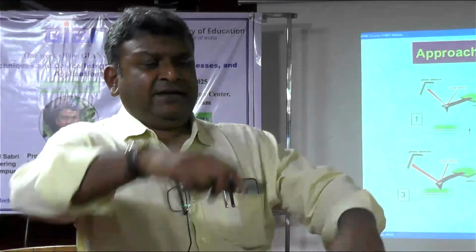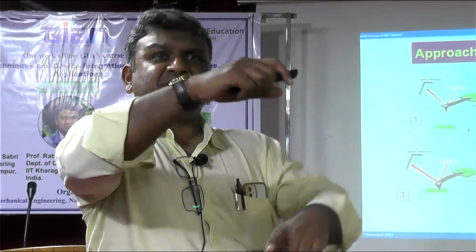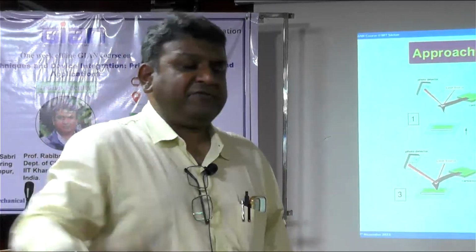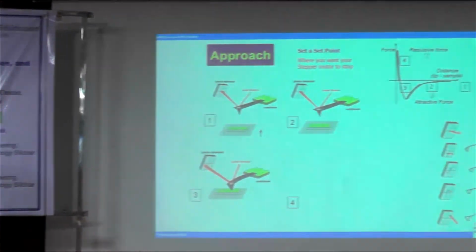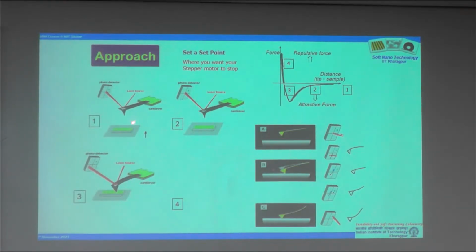So these two are separate. Either you move this downward or you move this upward with the help of a motor so that the relative separation distance reduces. Fair enough. Now if you compare these two pictures, 1 and 2, what is the difference? There is no difference in the arrangement, because they are being manipulated manually by moving the screws here and there. The only thing you can see is that the separation distance reduces, right? But when they come even closer, what happens?